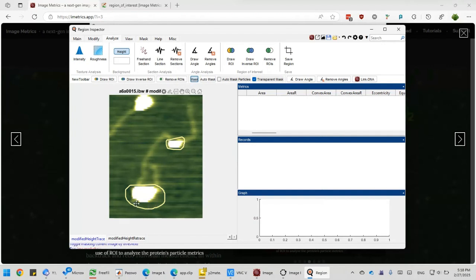Now the left bit of little exclusion might be real. Maybe just the DNA ends that extend beyond this protein, and that leaves a little bit of a bubble there. But the right edge, this is definitely bleeding, and especially since this is a trace channel. The scan direction scans from left to right. So this is a typical AFM image artifact, right?